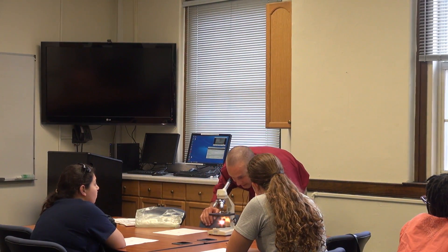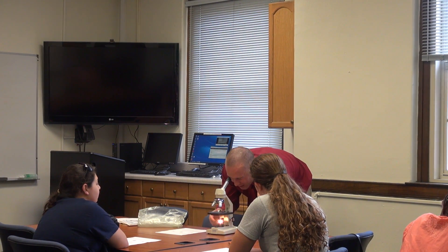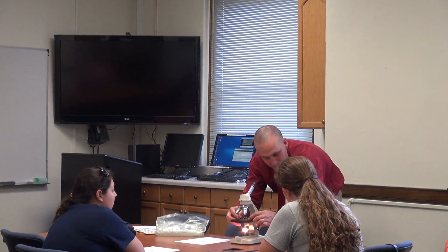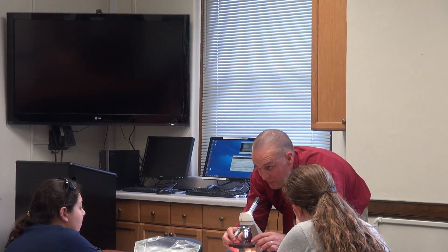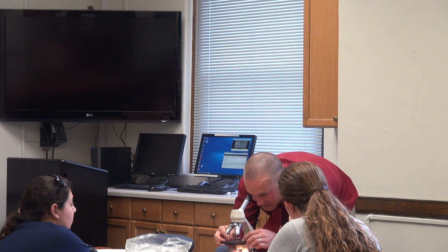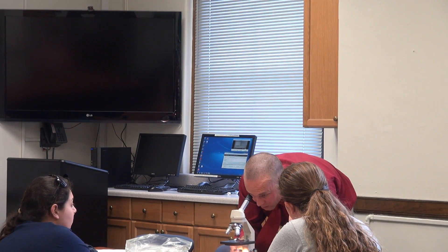I take a look through and now I can adjust my coarse adjustment knob — the larger one — in order to move the specimen up and down. I get it roughly into focus and I can see that it's just slightly to the up and right. So I'm going to grab the side of my prepared slide and move it. Remember, it moves opposite of what you would normally think. So I look through here, adjust it to where it's centered, and once again adjust my coarse adjustment.